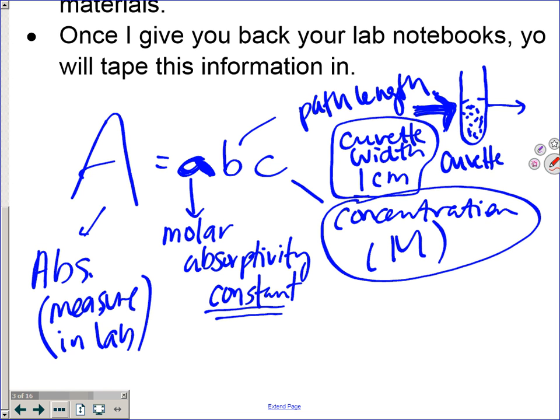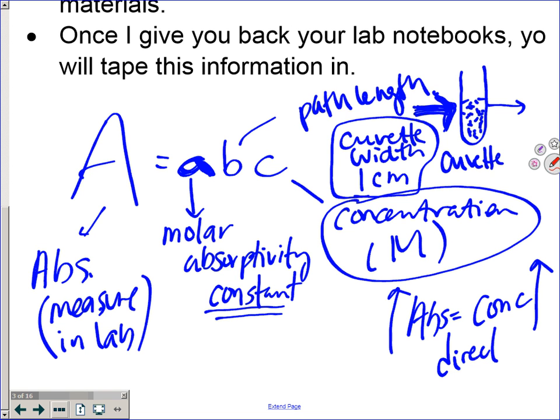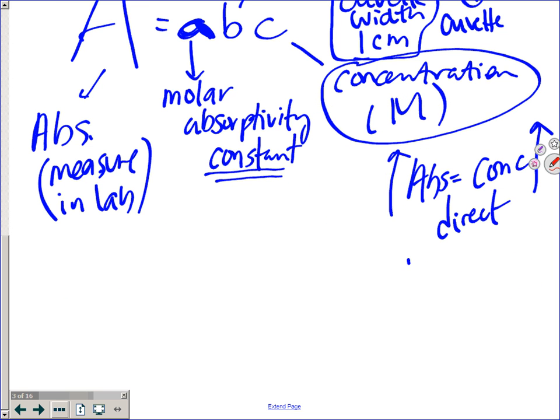Right, so the concentration we manipulate will cause the absorption to change. Concentration goes up, what happens to absorption? Can we get a consensus here, loud and proud? Okay, so as you concentrate your sample, the light can't get through, so transmission goes down, but absorption goes up. Would you say that's a direct or indirect relationship? Direct relationship. So you'd say these are proportional. Yes? Okay, just some terminology to throw at you.